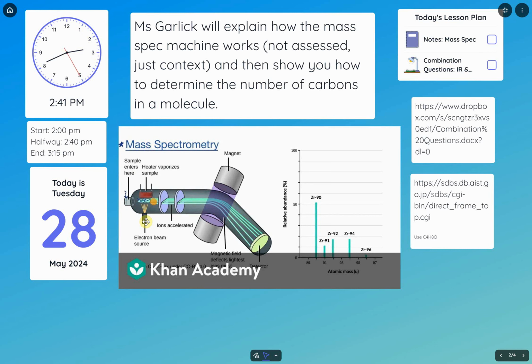All right. Now, organic molecules do not like being positively charged. They're not ionic. They're not ions. So being charged is really unpleasant for them. So they're not stable and they break apart. They can break apart in many different ways. When you think about an organic molecule, it can break apart in a lot of spots.